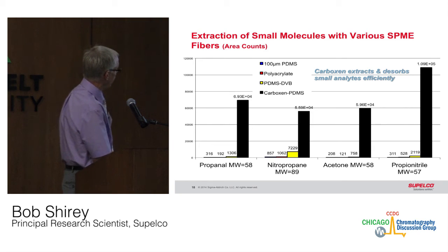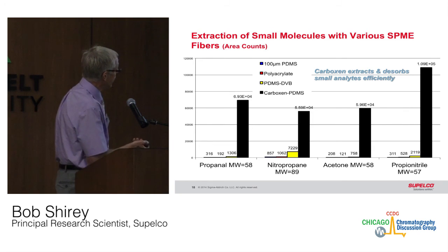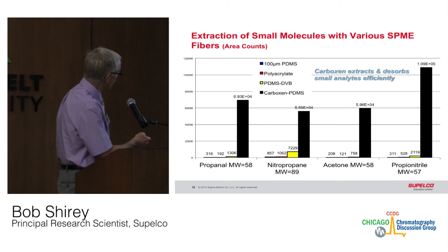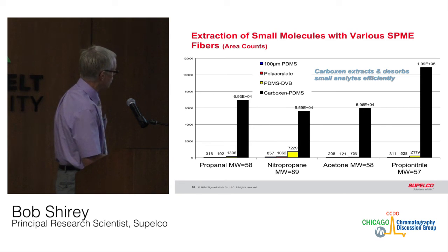And that can be seen very easily in this slide, where the Carboxen, shown in black, extracts nearly 200 to 300 times more than the 100 micron PDMS fiber. And these are actual area counts of the peaks. And so that shows the effect that the porosity has on retaining these smaller analytes. The larger pores of divinylbenzene, in yellow, is significantly less, because the pores are not meant to retain, but they do retain a little bit of these smaller analytes.